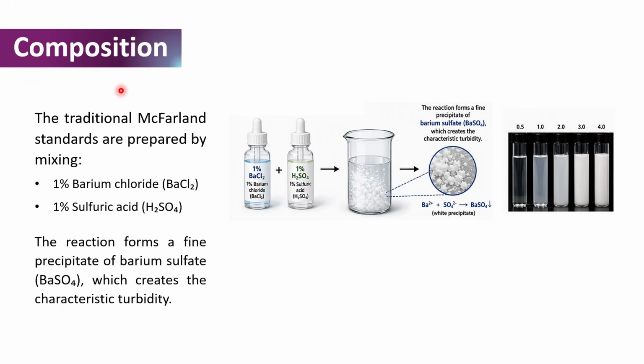Let's look at the composition of the McFarland standard. McFarland standards are prepared by mixing 1% barium chloride and 1% sulfuric acid, and the reaction between the barium chloride and the sulfuric acid produces a precipitate of barium sulfate, which is seen as the turbidity characteristic of the McFarland standard.